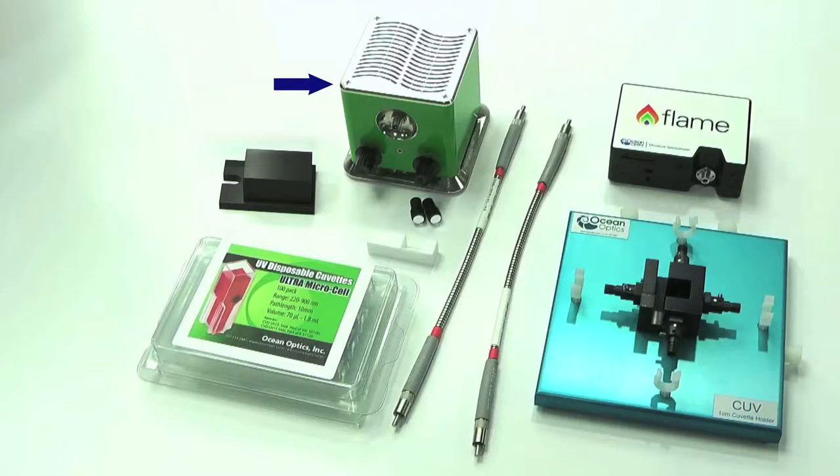The LLS high power LED light source with an output at 365 nanometers. This series of narrow band LED sources are ideal for fluorescent measurements.